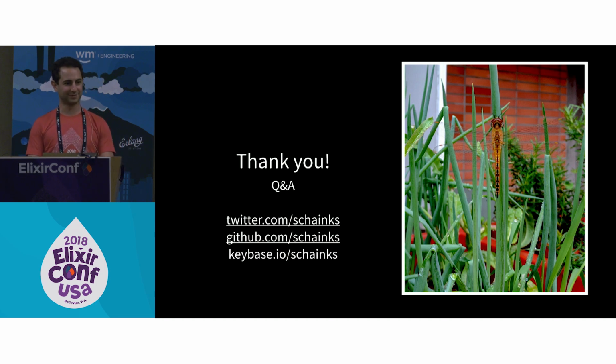So you mentioned things are growing slowly. Do you have any idea what would be optimal or in current industry? I think what would be optimal and what is close to optimal is once every few days. There's one paper I read where they could do it every 2 days. But what they did was they deliberately fed the algae tons of sugar to make it grow faster. And yeah, that works. And in the industry, they actually use different sugars to make the algae optimized for certain characteristics, like whether or not you want fatty or cellular walls, or whether or not you want more organelles of a certain type.